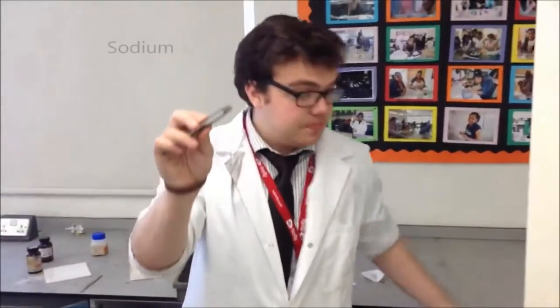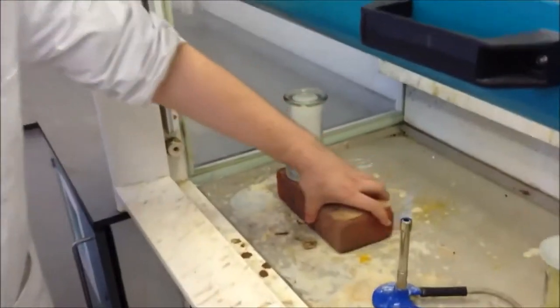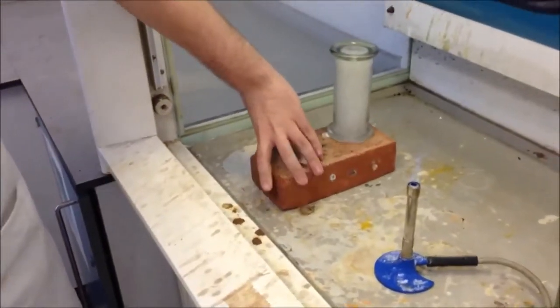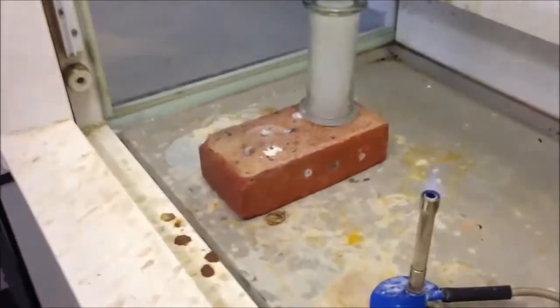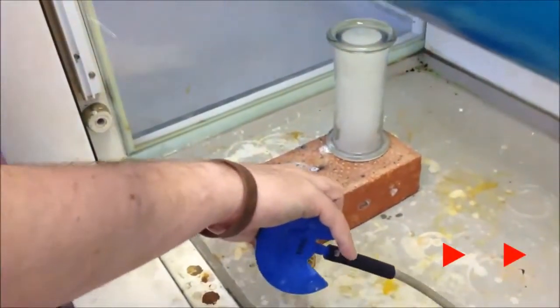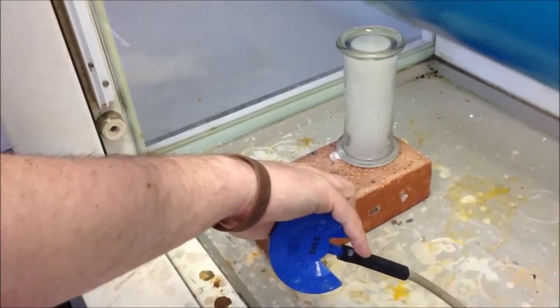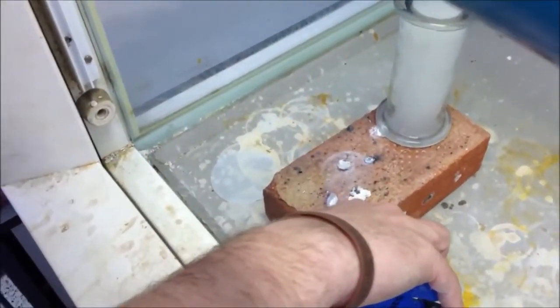We've got a fresh piece of sodium. As you know, sodium chloride, which I'm going to make here, is salt. So this is a reaction to make salt. Set it on fire. Notice how the sodium is melting before it sets on fire. That's because of the low melting point of sodium.